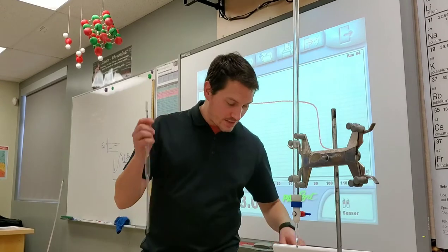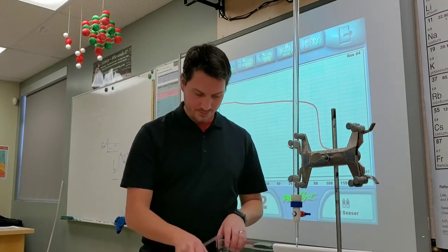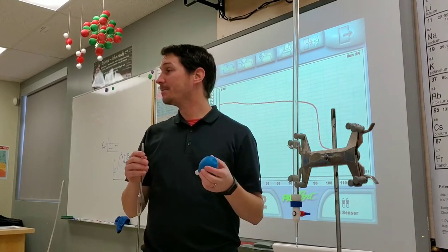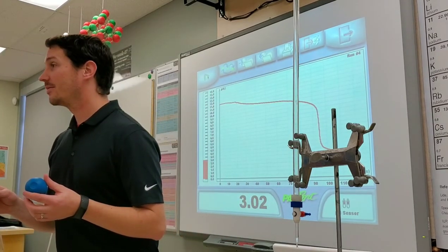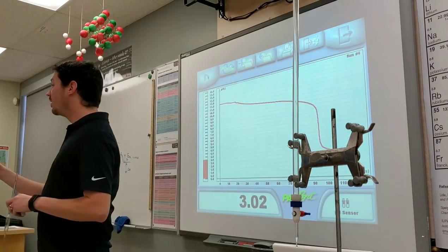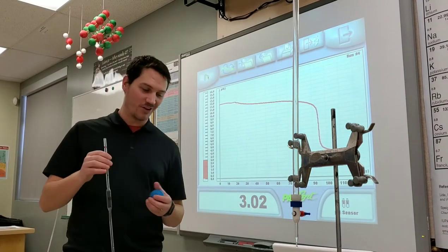So we're going to titrate a strong base. What's a strong base you would like to titrate? One of the strong bases. What is a strong base? Nope. I know those are strong acids, right? Sodium hydroxide or anything hydroxide, right? We're going to use sodium hydroxide, okay?